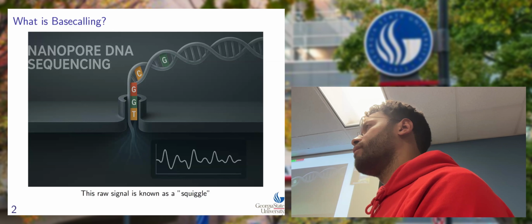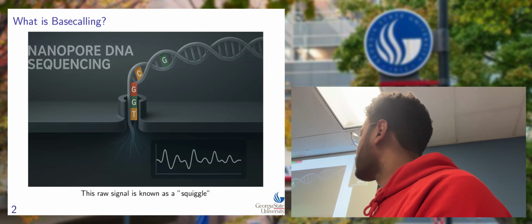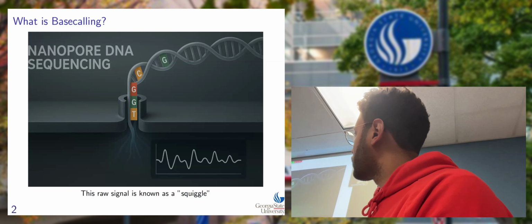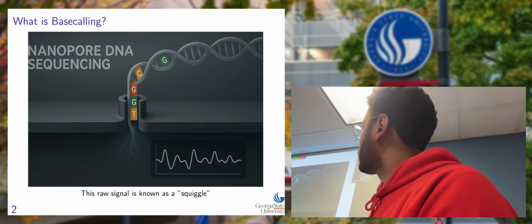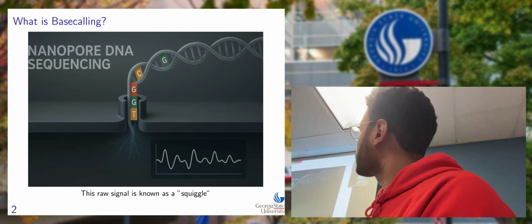Duplex is, rather than reading from the first character, which is T, and then G, and then G, after you finish reading everything, you flip back the head and start sequencing from the T again. So instead of doing T, G, G, C, G, now you go back and start G, C, G, G, T. That's duplex because you are base calling twice from both directions.